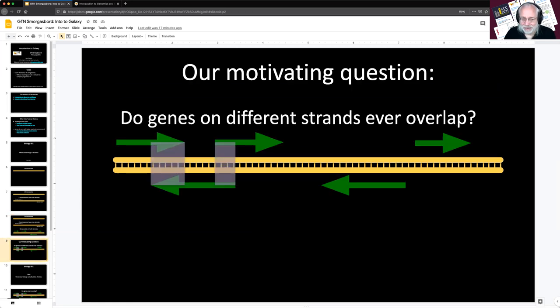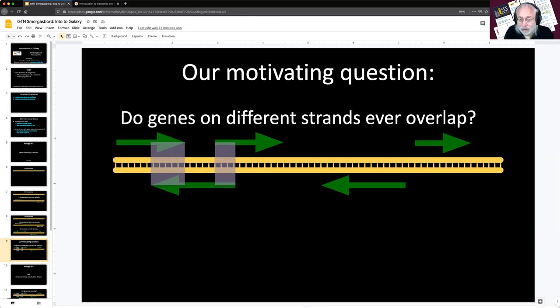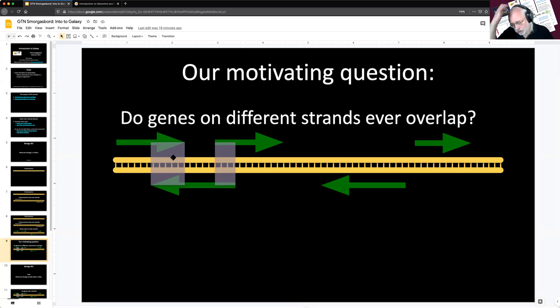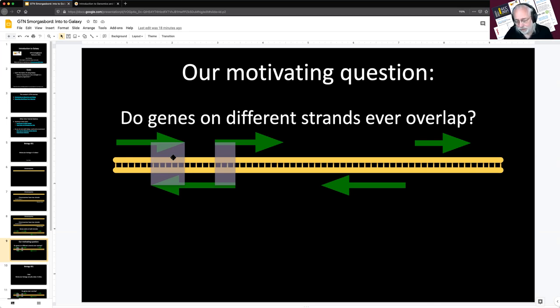Let's get to our driving question, which we're going to use to learn how to use Galaxy. It's a pretty simple question: do genes that exist on different strands ever overlap? Do we ever see a situation where we have a gene on the forward strand and a gene on the reverse strand that occupy the same space opposite each other?